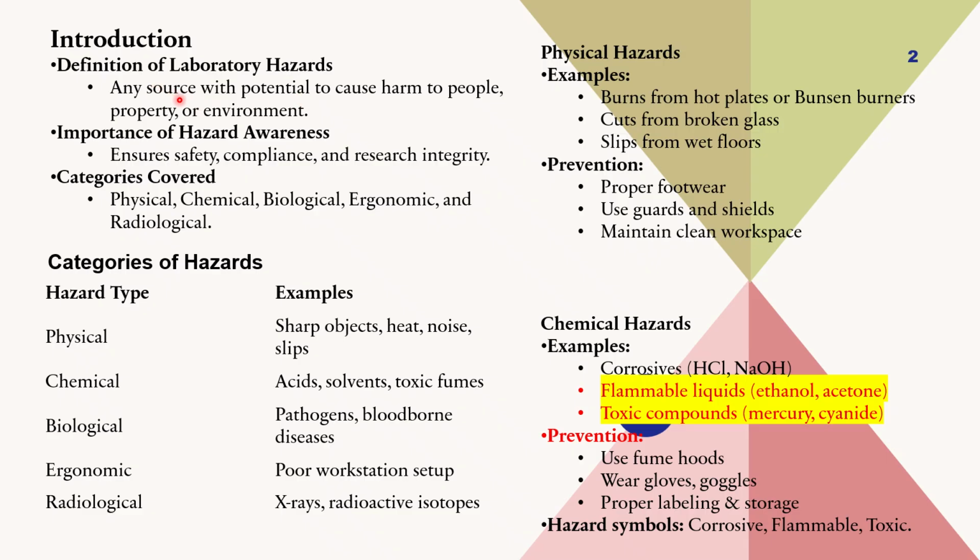Any source with potential to cause harm to the people, property, or the environment of the laboratory is known as a laboratory hazard. What is the importance of hazard awareness? Why should we know of the hazards? Because it ensures safety, compliance, and research and work integrity.